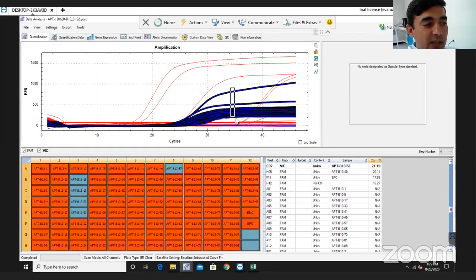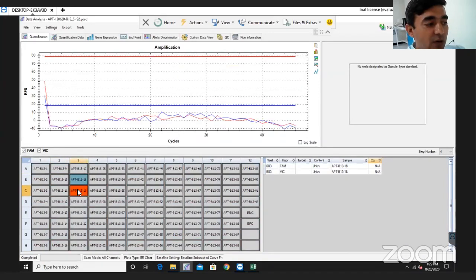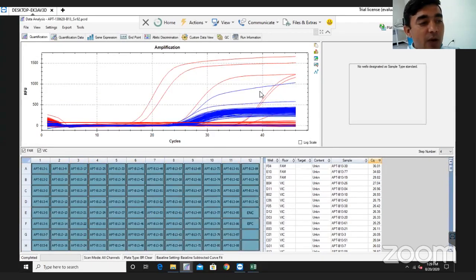Similarly, in this process there are two wells which are not positive for the internal control sequence. Over here it gives me the information that extraction from these two wells is not successful, and we need to repeat the extraction process for these two wells. So we immediately send these two samples again for RNA extraction, and the RNA is extracted from the sample and PCR is performed. And this way our process is validated. So here again we have some more information.